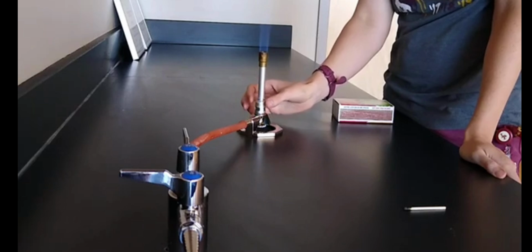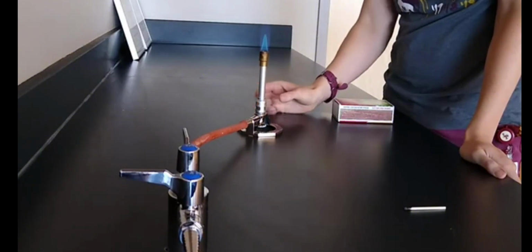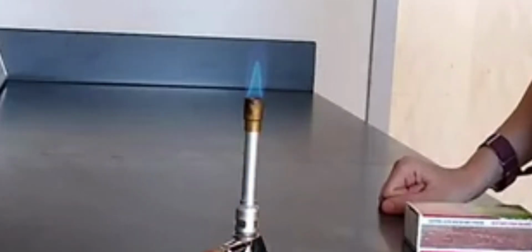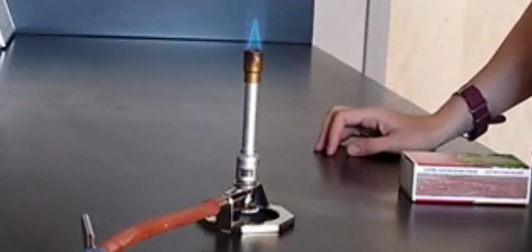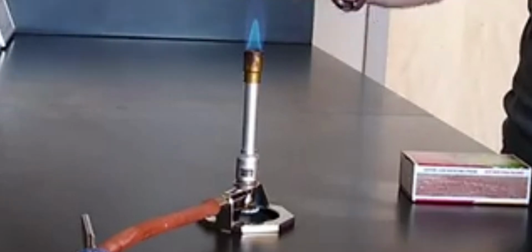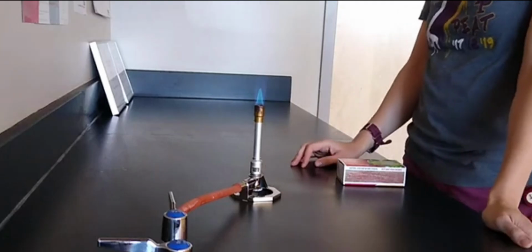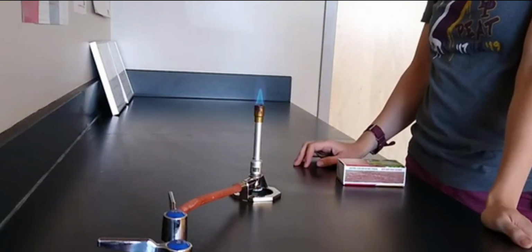So right now it's already blue, but I'm going to keep opening my air vents until I get a nice focused inner blue cone inside the flame of the Bunsen burner. And right at the tip of that very stable inner blue cone is the highest temperature part of the flame, and that's 1700 degrees Celsius approximately. Then we have that softer outer blue cone that has curvy sides. It's kind of hard to see if you don't have a dark background, but that is what our properly adjusted flame looks like. A double blue cone is how we refer to that.